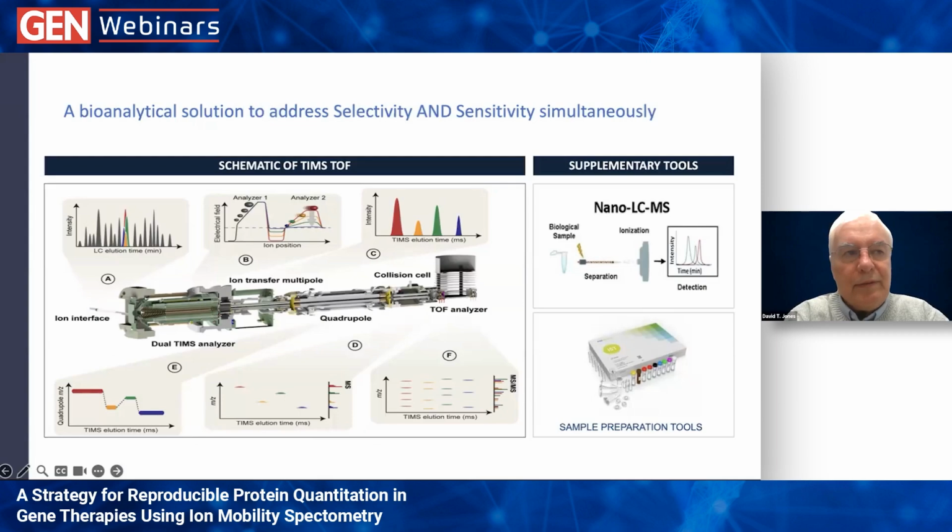That means instead of needing 50 milligrams of a tissue or 10 milligrams of a tissue, you can get away with fractions of a milligram. And so you can repeat an experiment. Mark says, sometimes you have to send things out for genome analysis or other forms of analysis or biomarker analysis. So if you're looking specifically at the proteome, you can really be economical with the tissues.